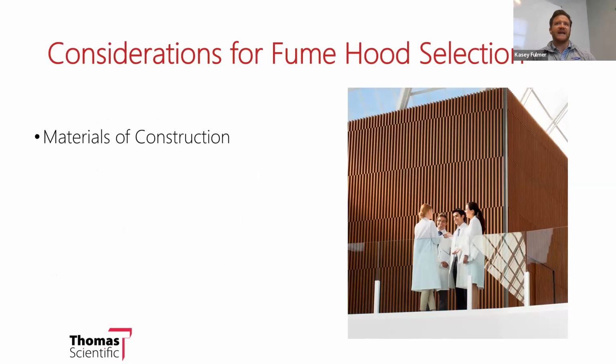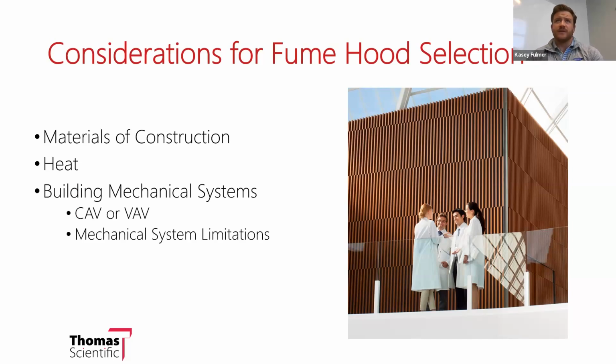What should the hood be made out of to accommodate all sorts of applications taking place inside fume hoods? Is there any heat involved, and considerations associated with using heat? It's very common to address the building mechanical system present in your building, making sure that the hood is set up to work with that.